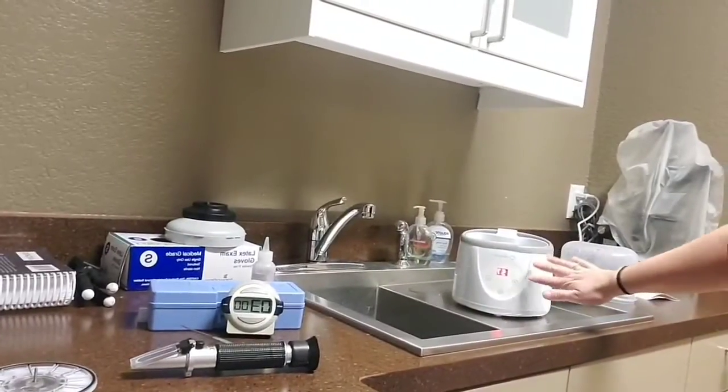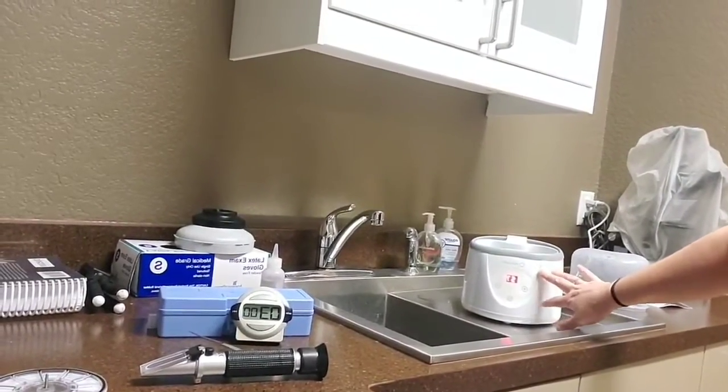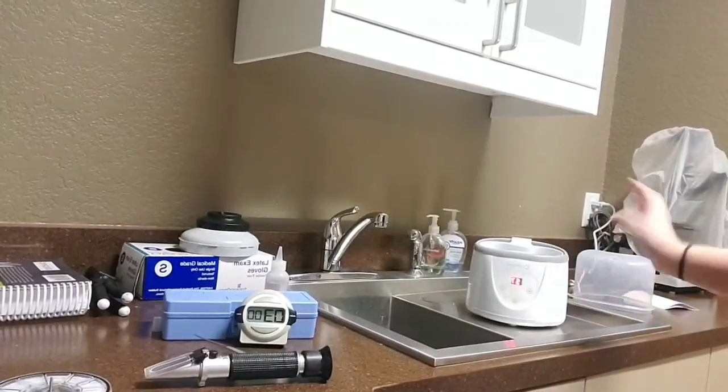And over here I also have our water bath, which has been fluctuating between 57 and 59 degrees Celsius. I think in the book it states 58 degrees Celsius, but it goes between the two. So we'll go from there, I guess. So let's go ahead and get started.